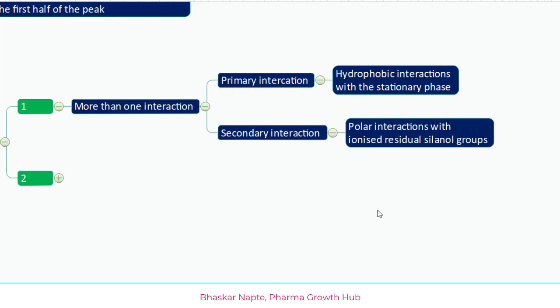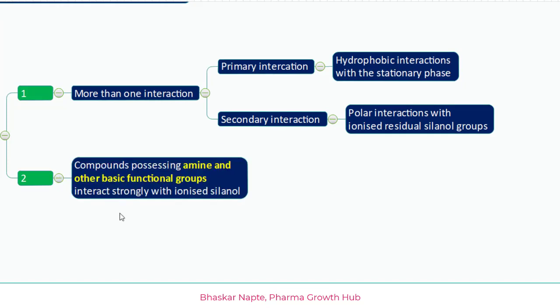Before discussing how to overcome secondary interaction, let us understand the second reason for peak tailing. Compounds possessing amine and other basic functional groups can strongly interact with silanol groups. If they have stronger interaction with the silanol groups, you can see stronger tailing happening.